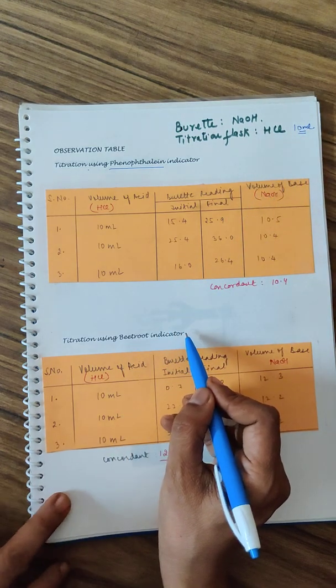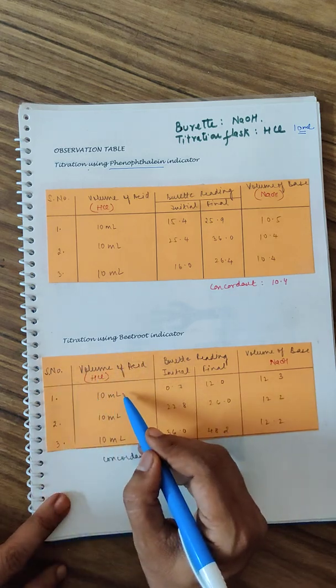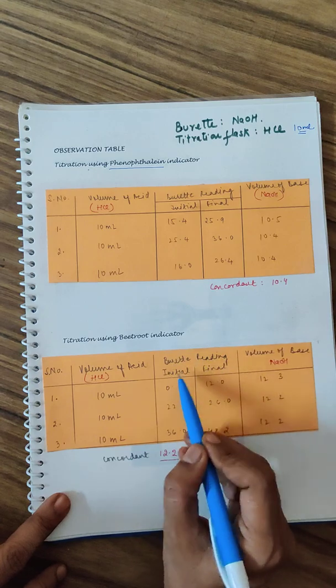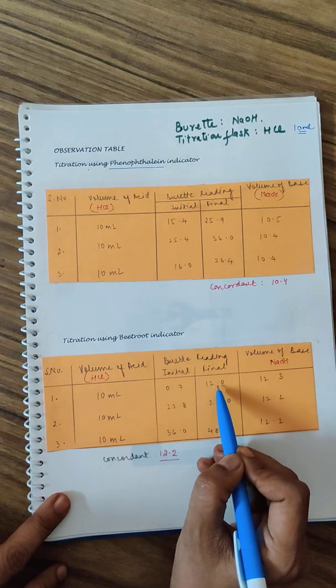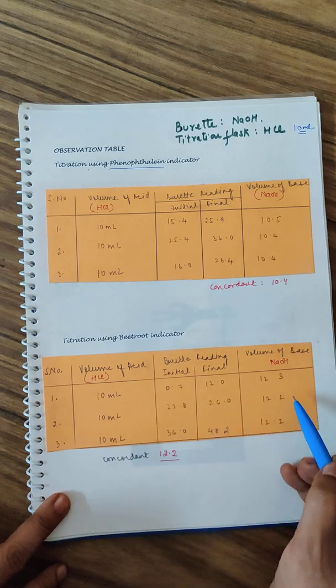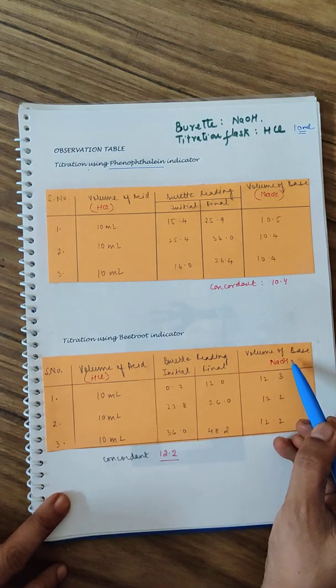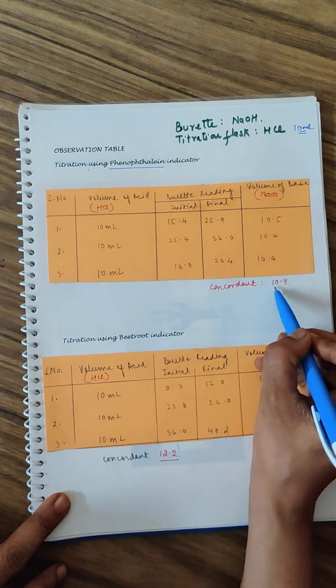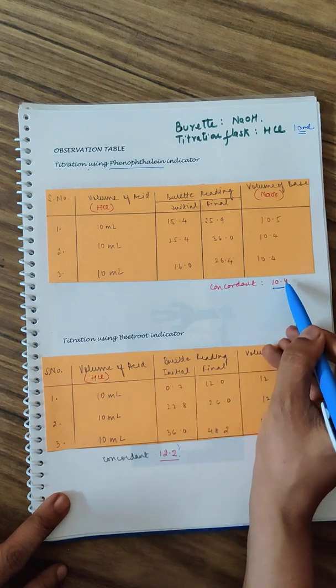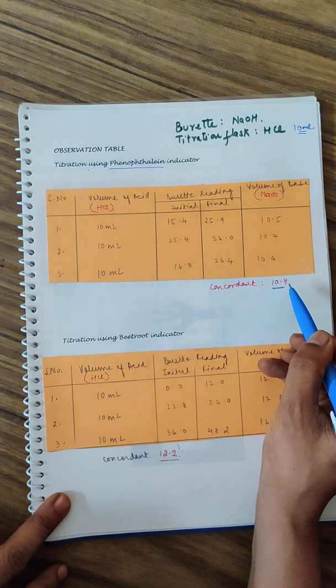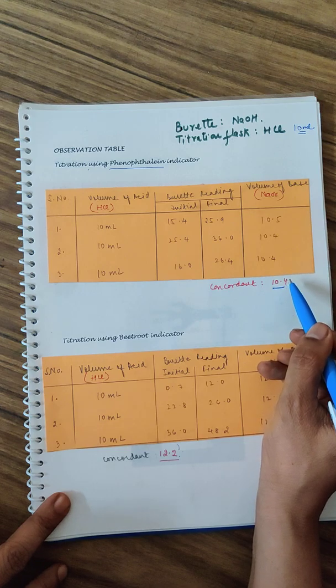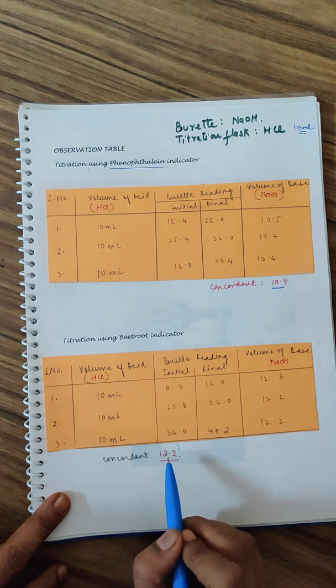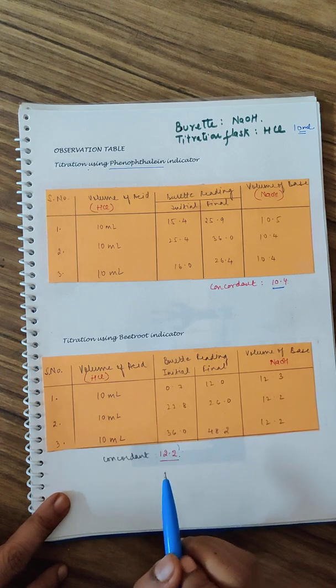Again you will be using your burette with NaOH. Titration flask me HCl lena 10 ml and add two drops of your beetroot indicator. Then start adding from the burette the NaOH. Initial and final reading monitor kariye, find out the volume difference to get the volume of NaOH used. The value comes out to be 12.2, the concordant reading. This value is more than phenolphthalein. Beetroot shows the color change when more base is added, means beetroot is showing a color change at a higher pH.